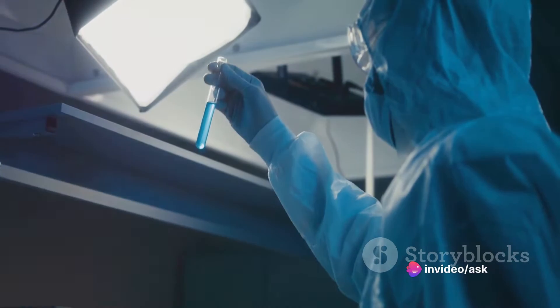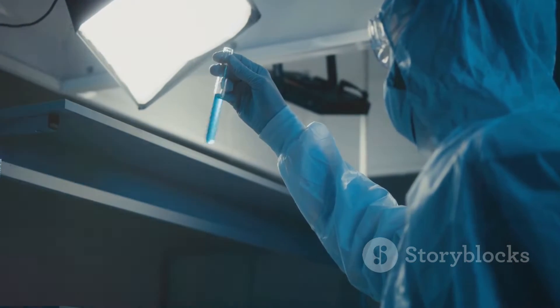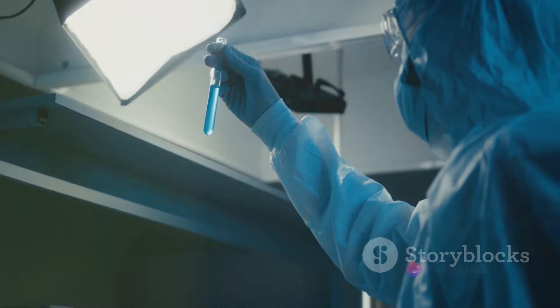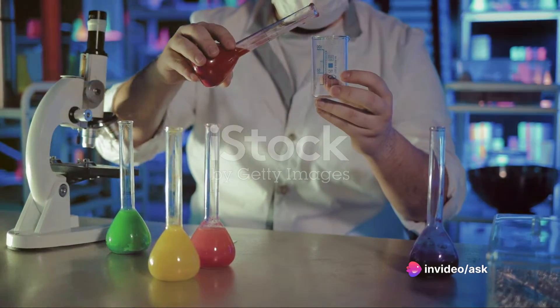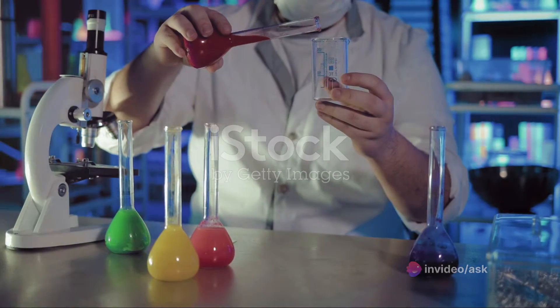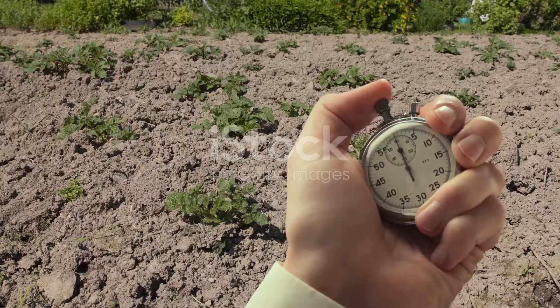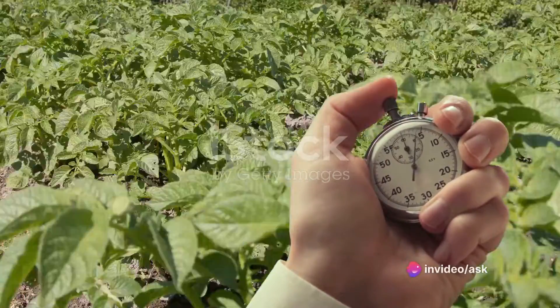First, peel an Irish potato, taking care to avoid any injuries. Using a cork borer, extract six potato cylinders from the peeled potato. Measure and cut these cylinders to a uniform length of 3 centimeters. Next, prepare two beakers. Pour distilled water into one, labeling it as A, and a sugar solution into the other, labeled as B. Place three potato cylinders in each beaker and let them stand for 40 minutes.